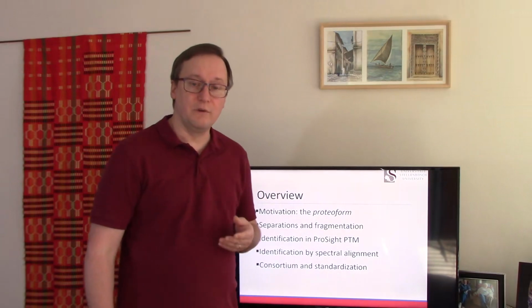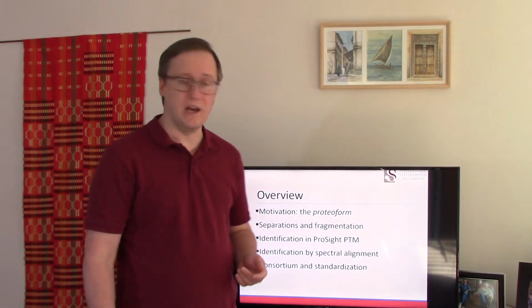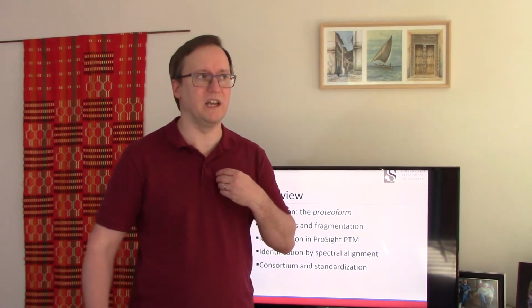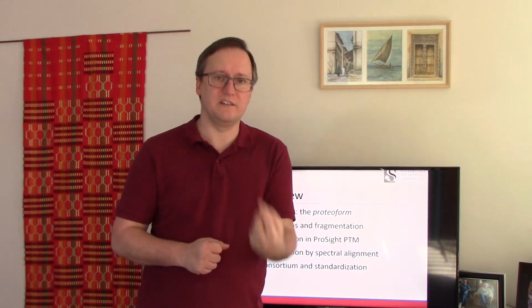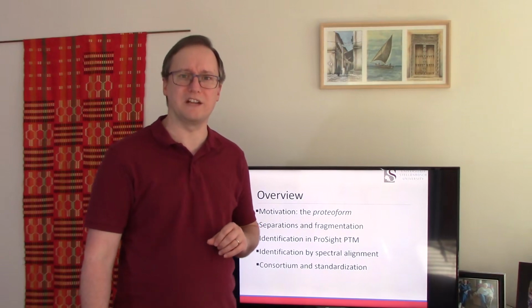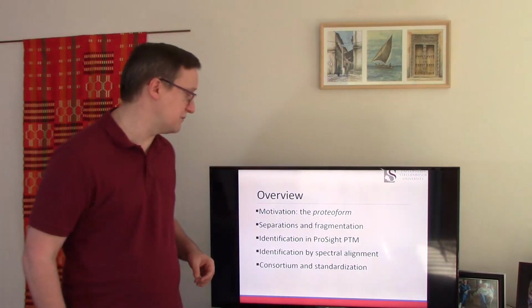We're going to start with the rationale for why top-down proteomics, at least theoretically, offers some real advantages over shotgun proteomics. And alongside that, we're going to discuss a definition that's recently been put forward for proteoforms. So that's going to be a linchpin that explains why top-down proteomics has so much to offer. From there, we're going to spend a little bit of time talking about analytical chemistry. I know that might not be usual for a bioinformatics talk, but these are really key aspects of top-down proteomics that make it quite different from shotgun. So I think it's worth discussing in some detail.